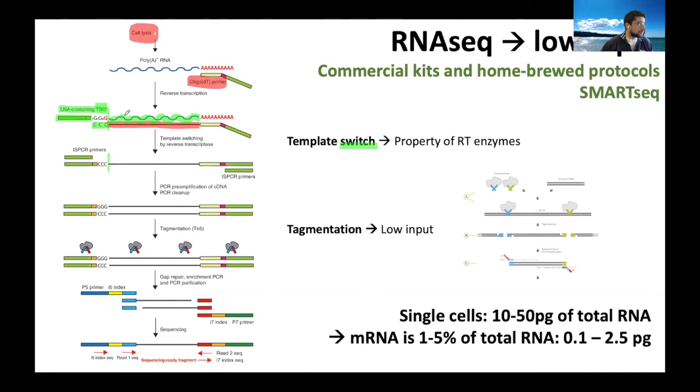So from RNA here, it switches to the DNA oligo here, and now it copies the information. The result is you have a primer handle in green here, and another primer handle that I just highlighted here, at both ends of the transcript.